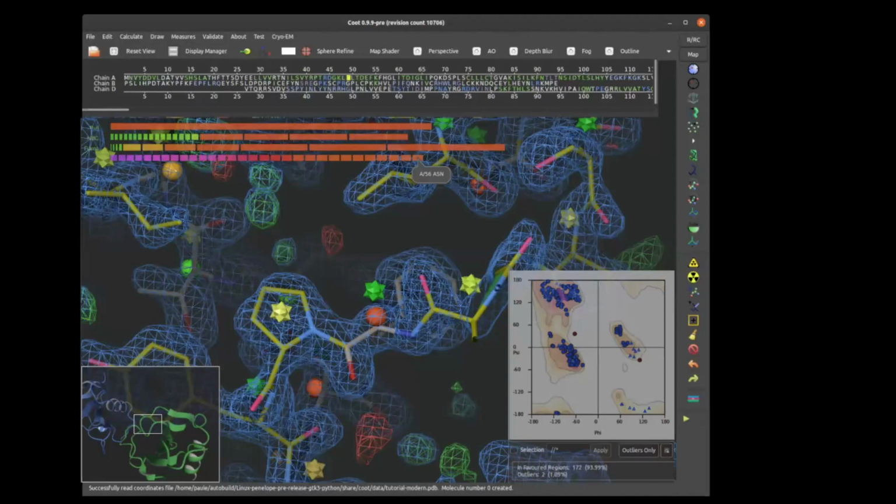Bottom left-hand side, we can see a mini-map, which shows which part of the protein it is that we're looking at here, or trying to optimize. On the right-hand side, there's a revealer that is providing us with a transparent Ramachandran plot. So you can see that changing as we adjust the model. This doesn't exist today. Lots of the components do exist, but the concept of embedding it all into one frame with revealers doesn't exist. It's where I'm going now.